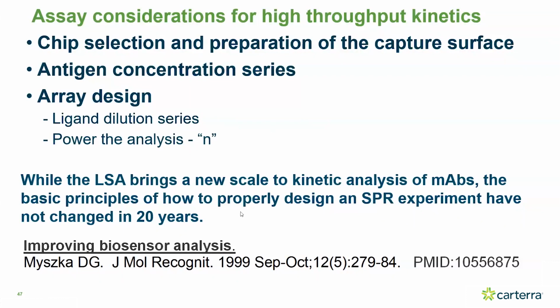But it's important to note that while the LSA really brings a new scale to these types of kinetic analysis, we're not changing SPR at all. And so we often refer people to this paper by David Myszka in the Journal of Molecular Recognition from 1999, where he outlines many of the key parameters of how to properly design and execute SPR experiments, as well as how to report the data. We don't think anything's changed, and we're trying to be consistent with these fundamentals that have been put forward some time ago.